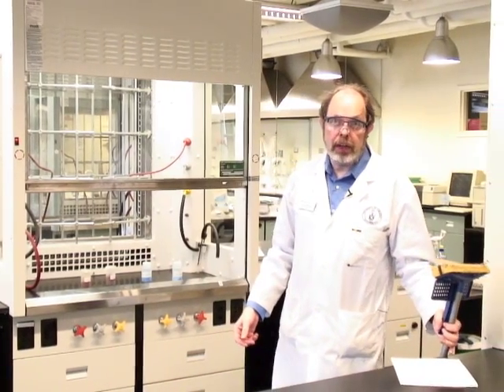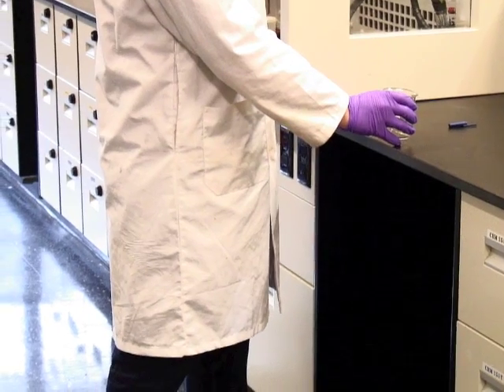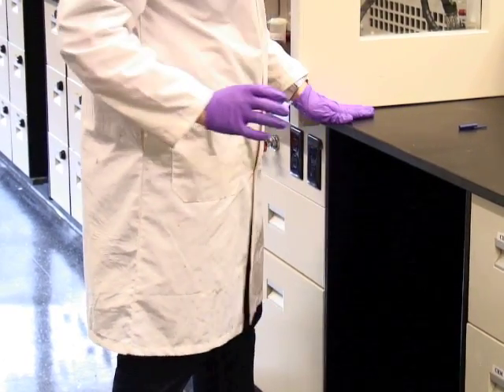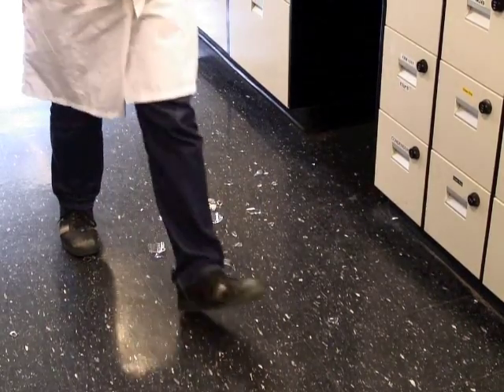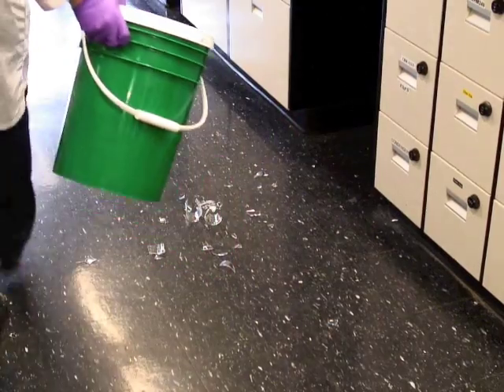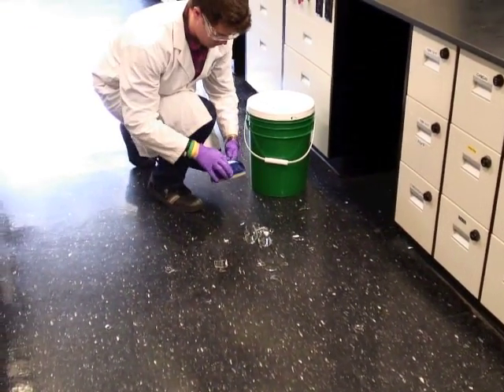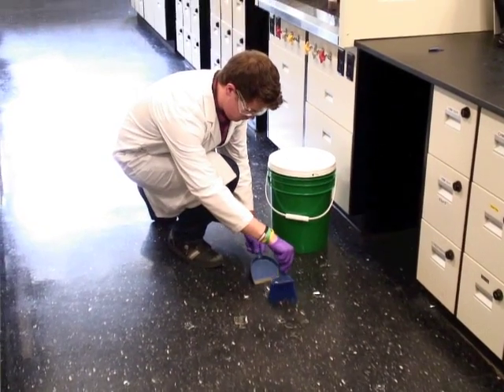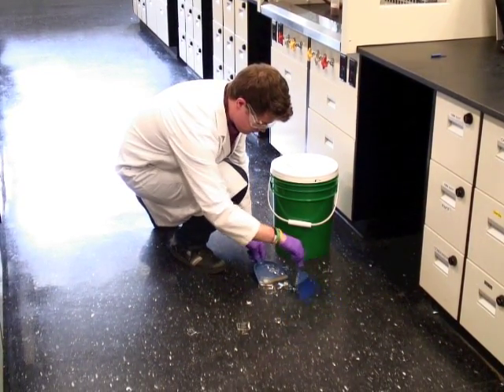Then again there's broken glass. If you break glassware, get the dustpan and brush from under the sink. Go to the broken glass container which is under the sink. Bring the green broken glass bucket to the site along with the dustpan and brush. Brush all the debris into the pan and put it inside the container. Don't use your fingers to pick up the shrapnel.